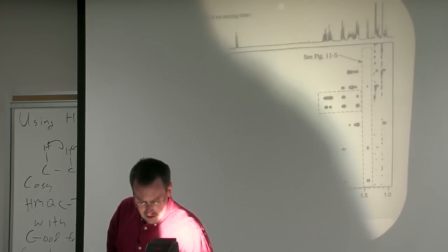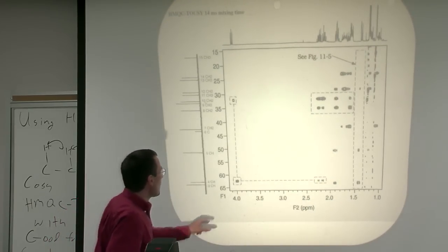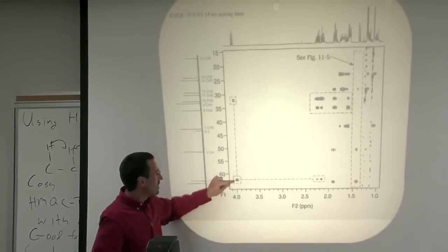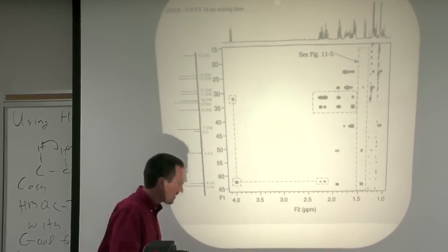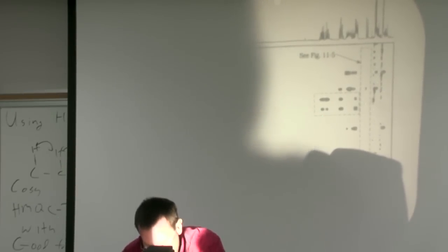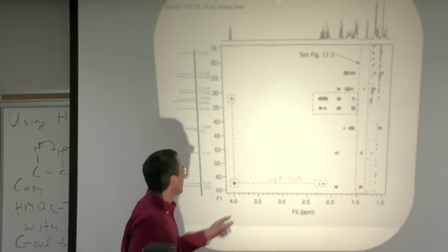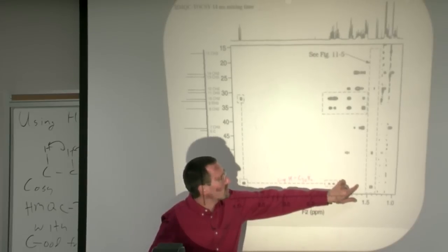So here's the 14 millisecond mixing time actual spectrum, and this is the schematic of the slice that we just looked at. So this is the 14, so I'll write 14 millisecond up on the top. And so this hop here is our C4H to C10H2 hop at this point. And as I said, if we continued on, we'd see a next hop here.